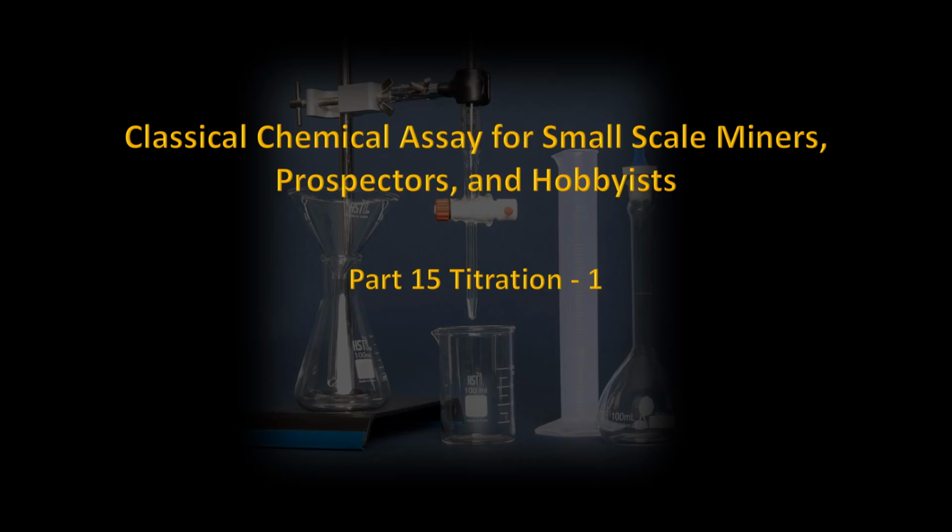In Part 14, the focus was on the subject of equilibrium, the basic theory which allows for the volumetric analysis referred to as titration. Well, in this presentation, the opening topic focuses on what a titration is, the ideal conditions of which will determine a successful analysis, its disadvantages, as well as the advantages for conducting a titration, and the terms that will be used throughout this and the next set of presentations.